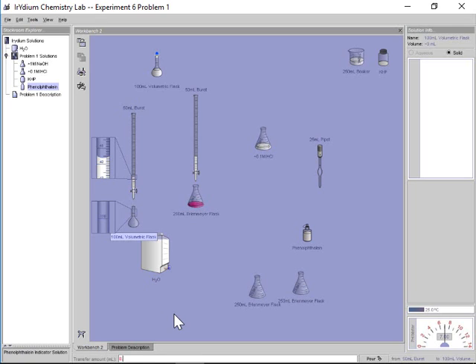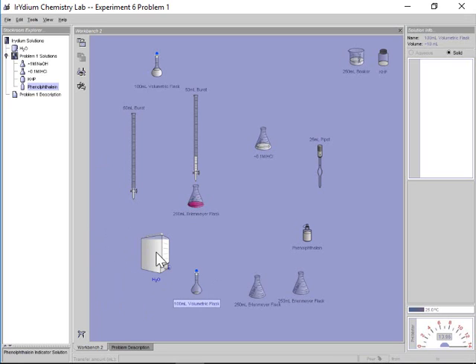So for my calculations, I'm actually going to do my new dilution. Let's do 8 mils, right? So you notice I'm still not at the 50 ml mark. I can still read that well. So I have 8 mils, and again, I'm going to be ready to do my dilution here. Water over the volumetric flask. So this is another dilution. This time I've only used 8 mils.